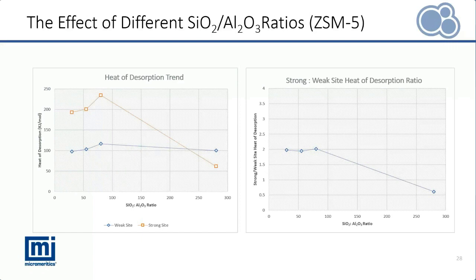However, the 280 to 1 sample doesn't follow this trend. This seems to reflect the difficulty associated with analyzing a material with very little acidity. As the ratio increases, the number of acid sites decreases and the material becomes more hydrophobic, so there may be more difficulty in accurately measuring the acidity. The graph on the right plots the strong to weak site heat of desorption ratio, which nicely depicts how the binding strength of the strong sites is consistently twice as strong as that of the weak sites. Again, the 280 to 1 sample falls out of trend due to this experimental limitation.